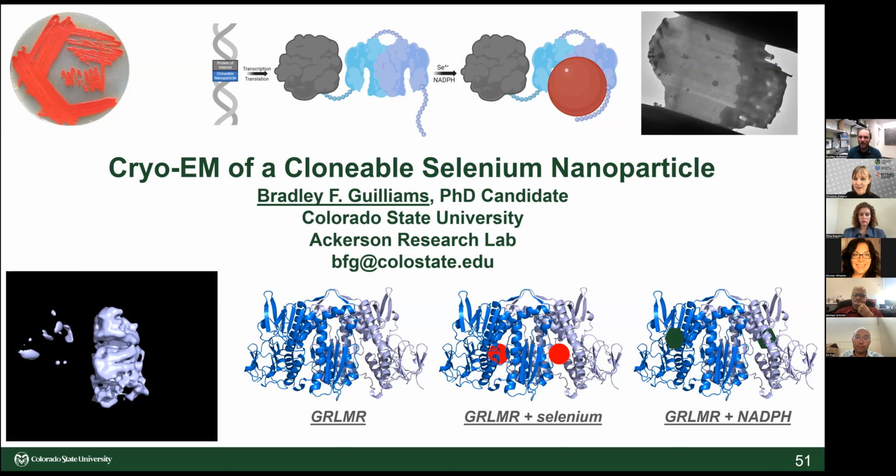I think my problem was junk in my particle stack, and that was my problem for a while. Now I think I'm limited by the alignment to a single homodimer structure.